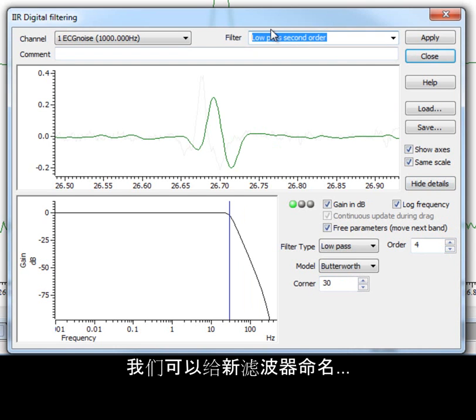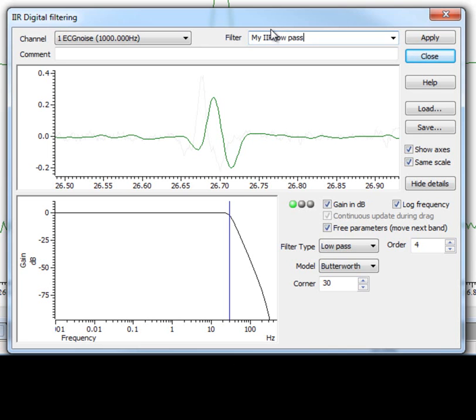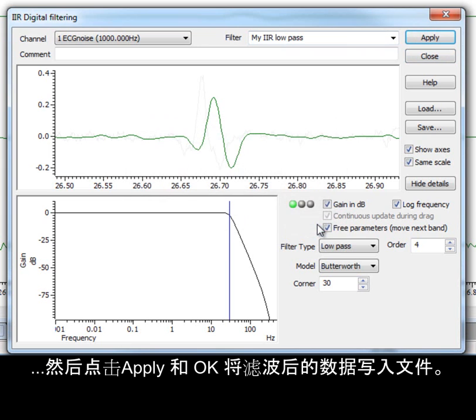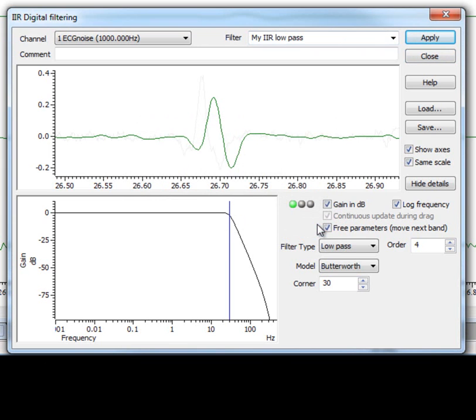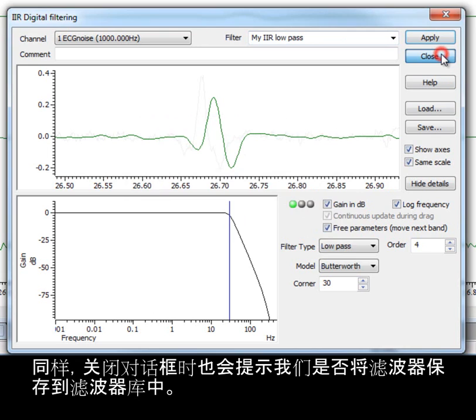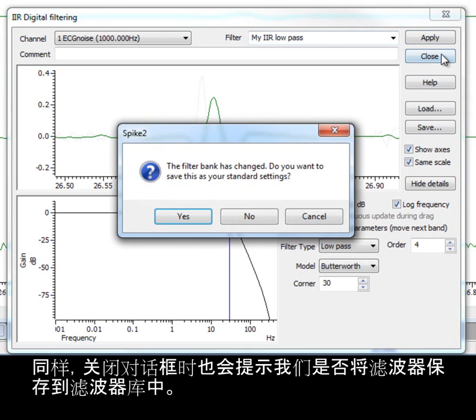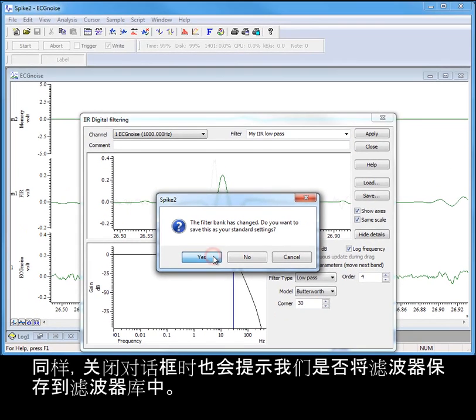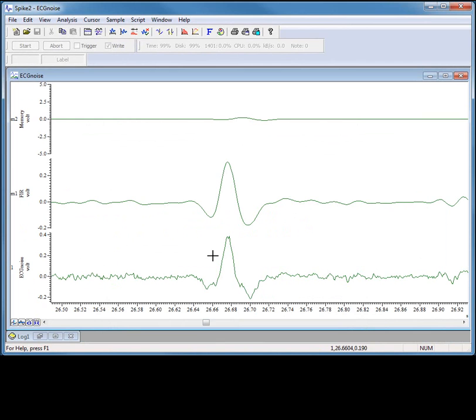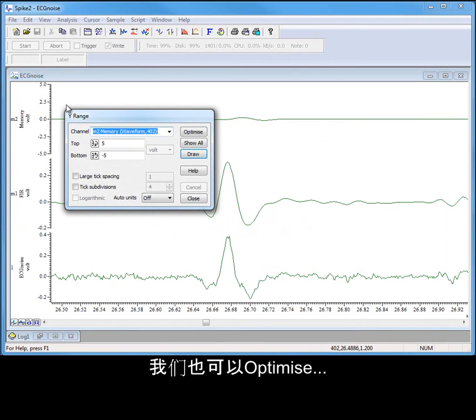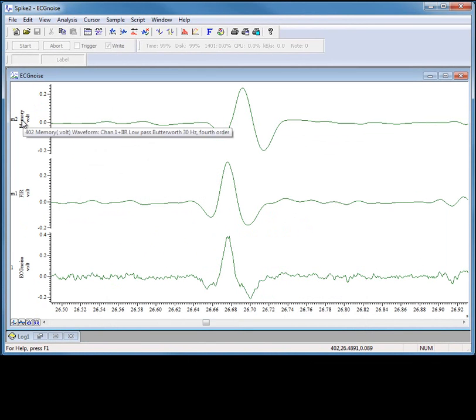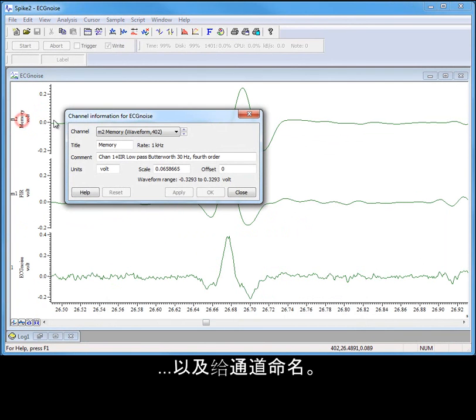We can give our new filter a title. And then click Apply and OK to write the filtered data to our file. Closing the dialog will again give us the option of saving it to the filter bank. Again, we can optimize and title the channel.